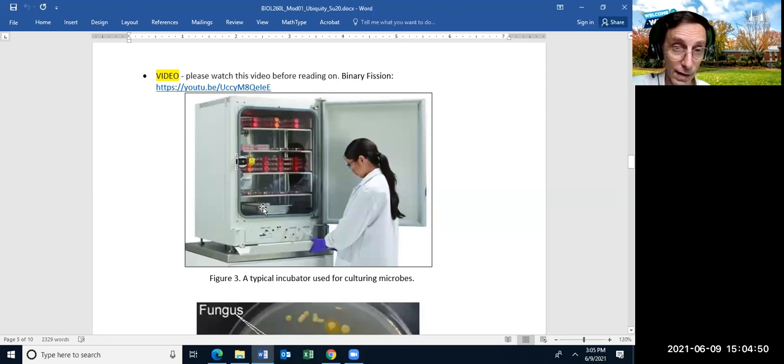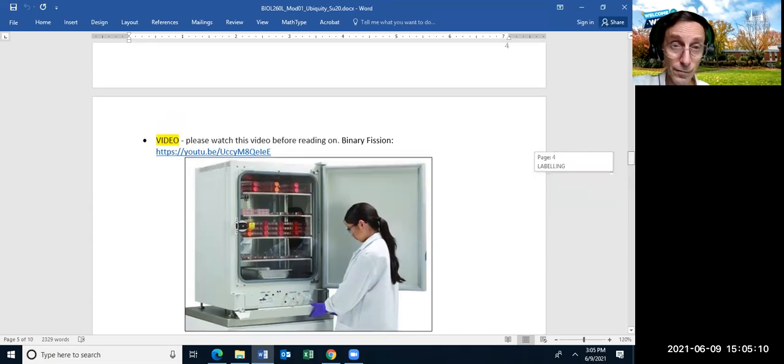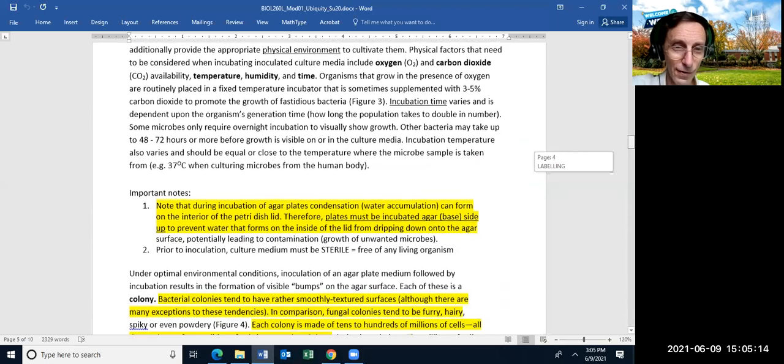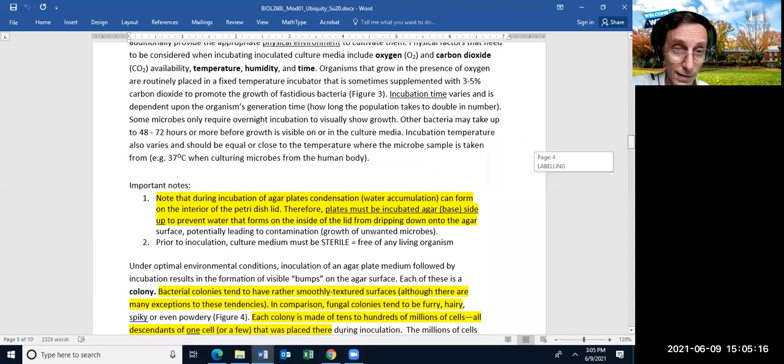You can also change the humidity and specify directly what it is. Ours are much simpler than that. We just make it more humid inside the incubator than outside, and how we do that is we add water to the incubator. You don't need to know any of that. You just need to know a little bit about what an incubator is.